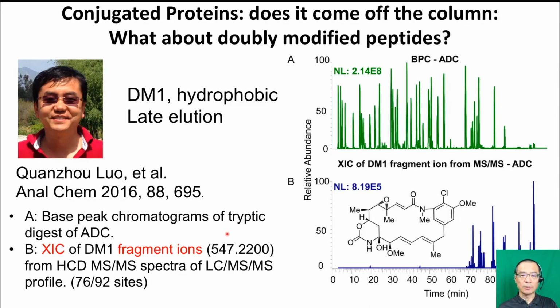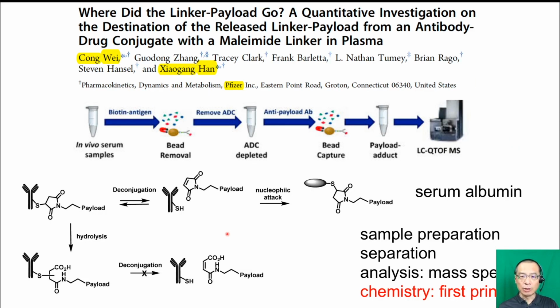The characterization issue is on the bioconjugation. So antibody-drug conjugate has become quite a new modality, and this is an excellent work by Zhou at Amgen, as he used the existing workflow to characterize many of the antibody modification sites. And this is another example of the challenge of detecting all the chemical events for bioconjugation, and some of the events, such as reversible modification of ADC, have been difficult to detect. You have to use a different approach.